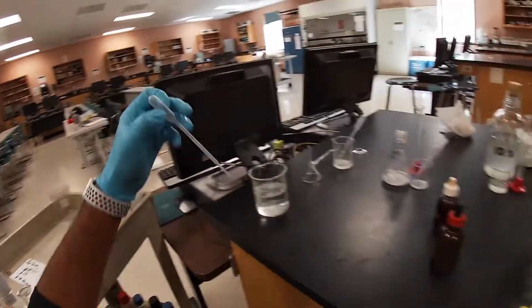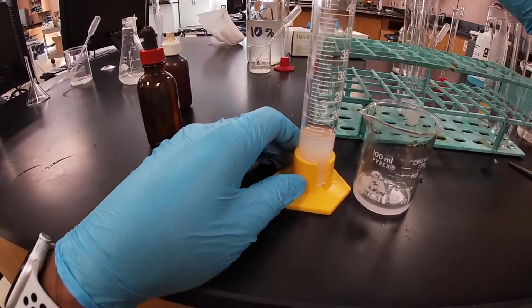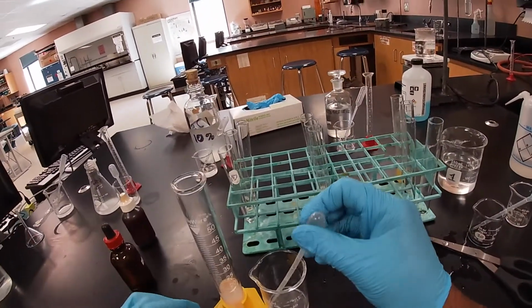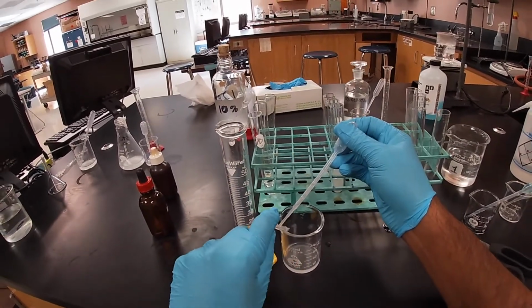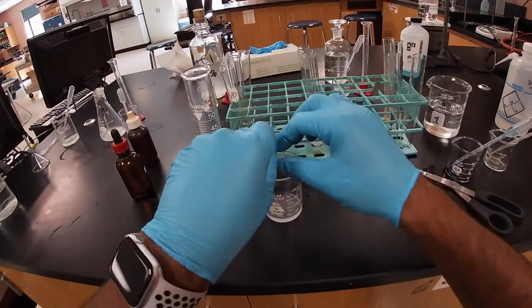So we'll grab a pipette, and all we gotta do is a little bit, and we're gonna distribute our 15 milliliters. Oh, I still have some dialysis tubing there.